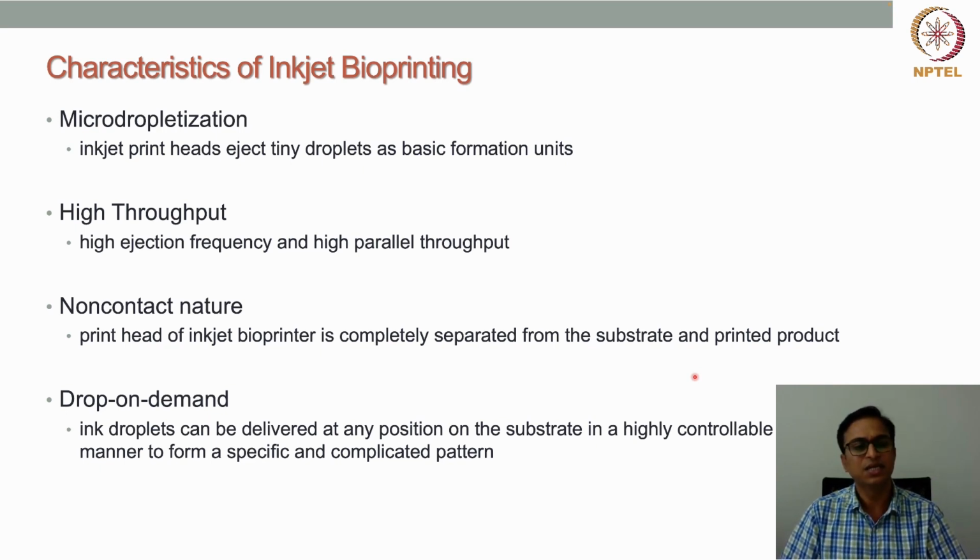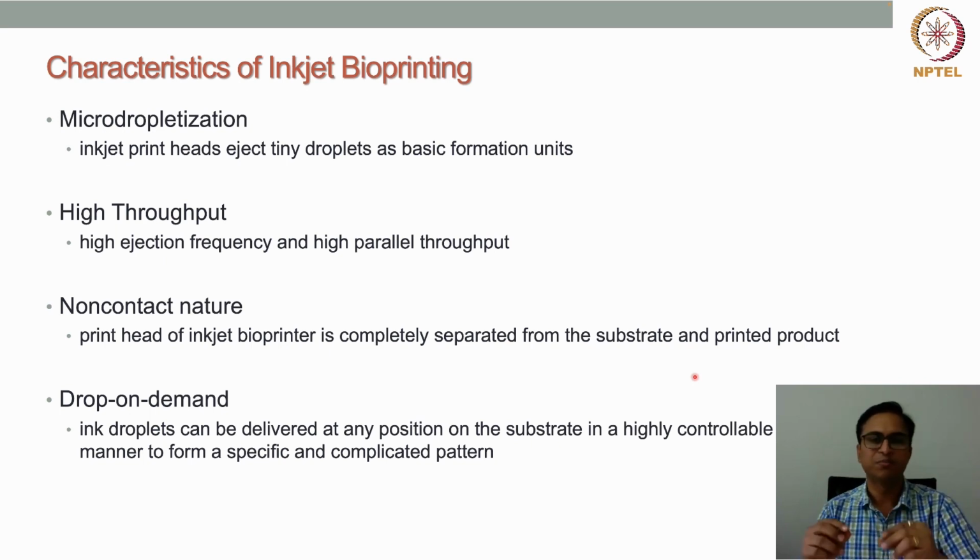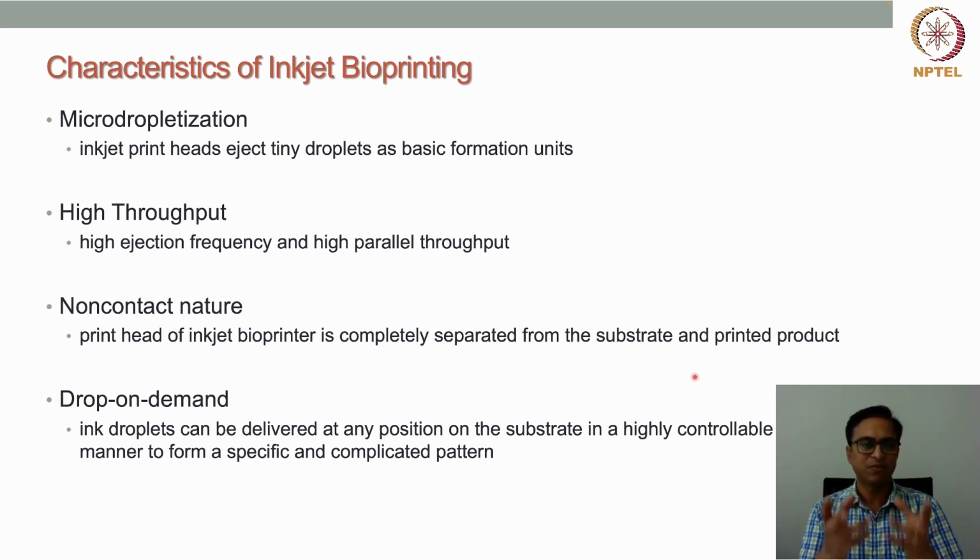Another important characteristic is the non-contact nature, because the print head and the stage are separated from each other. They do not come in contact at any time, and they are not connected to each other by any material either, because discrete droplets are created and they fly from the nozzle to the stage, to the substrate, right? So that's a very good advantage for various applications, which is why this technology is very popular for certain applications.